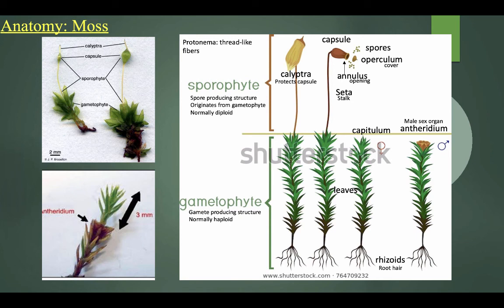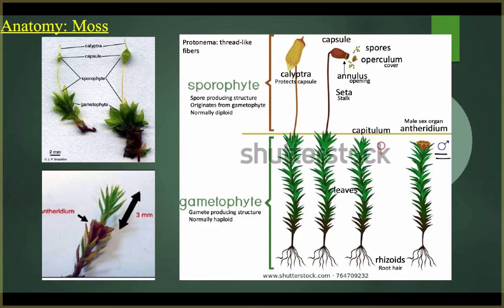When you get to the lab itself, it's going to first start with the liverwort and then go into moss. I start with the moss because I feel like it's a little bit more simplistic, in that we're not looking at both asexual and sexual reproduction. We're focusing on sexual reproduction here. You can see in our example that we have both a male and a female version of this moss. And these 3 are examples of the different stages you see within the formation of gametes and spores for the female moss and the male moss here.